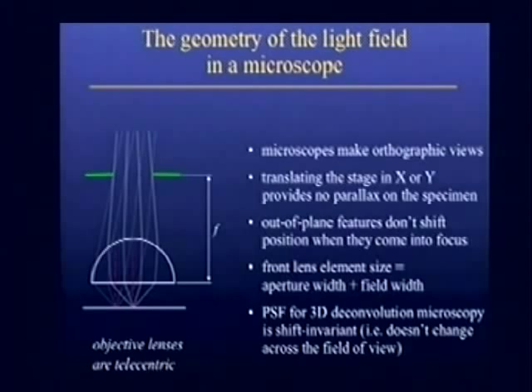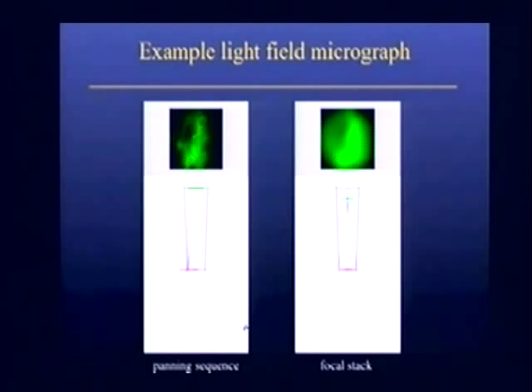All right, so with that proviso, we now know which rays we've captured, and we can show oblique views like this, and we can do focusing. That may not look very exciting to you, but a microscopist gets pretty excited about that because they don't see parallax in a microscope. And when I rotate it like this, I'm getting perspective views. I'm also getting parallax. I can see the sides of stuff. So you can use it to count cells or to see stuff that is occluded by other stuff without rotating the specimen itself, which is hard.